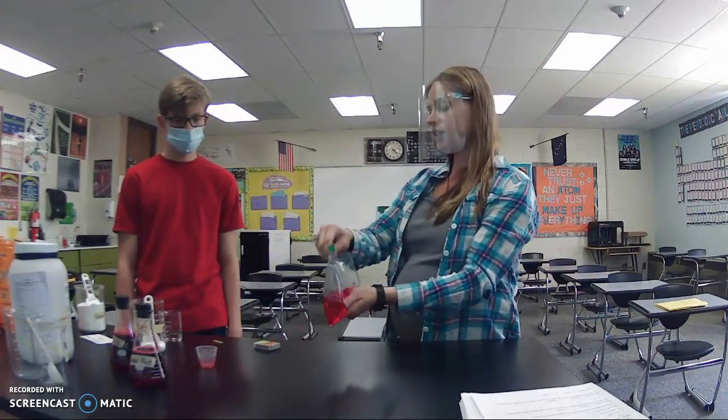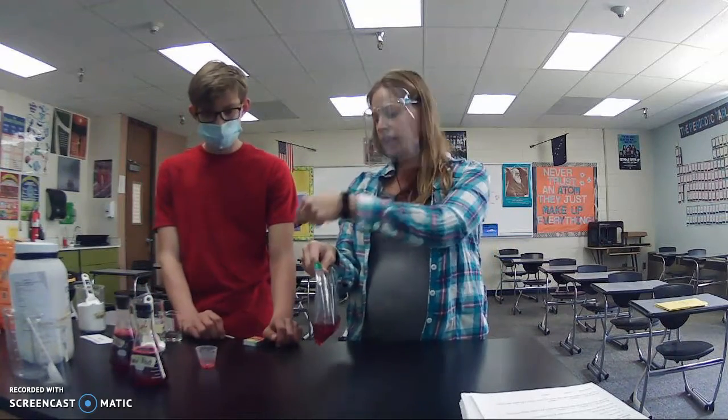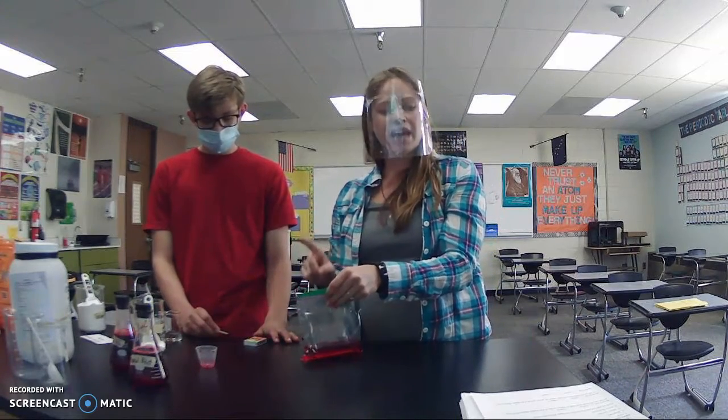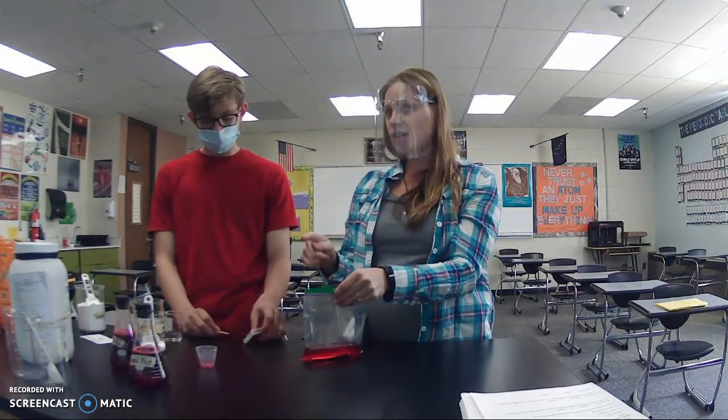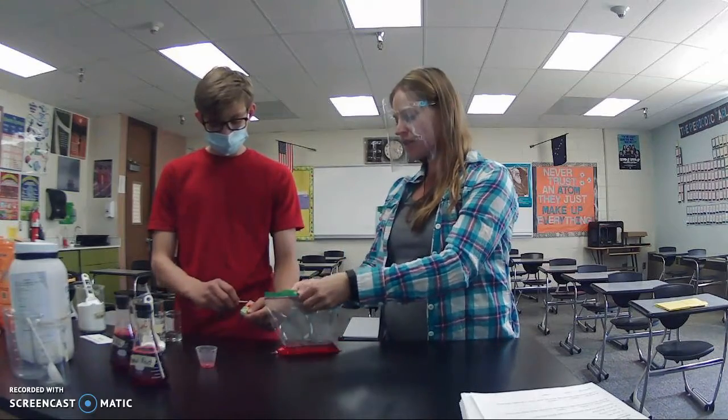And Jason is going to get ready to do a flame test. A flame test is when he's going to have a lit match, we're going to put it into the bag after I've allowed this to mix a little bit. If the flame goes out right away, that is a positive test. If it doesn't go out right away and he has to end up extinguishing it, then that is a negative test. Okay? So here goes the first test.